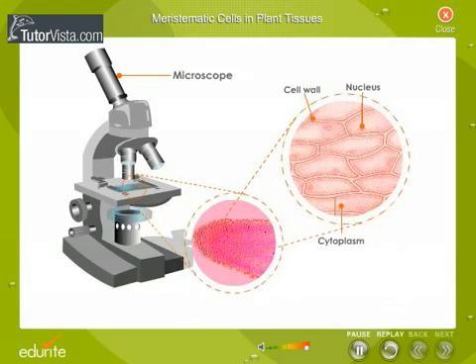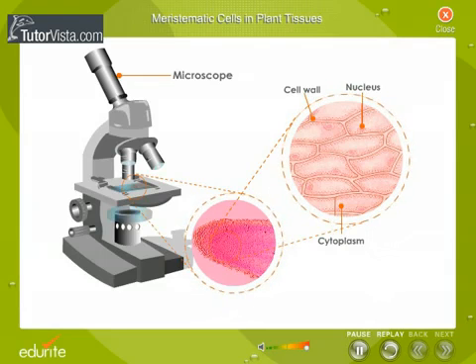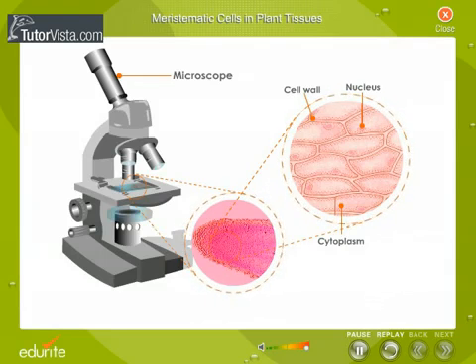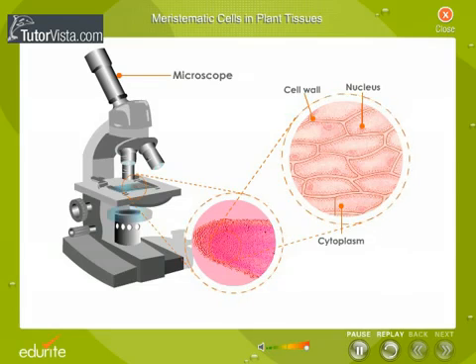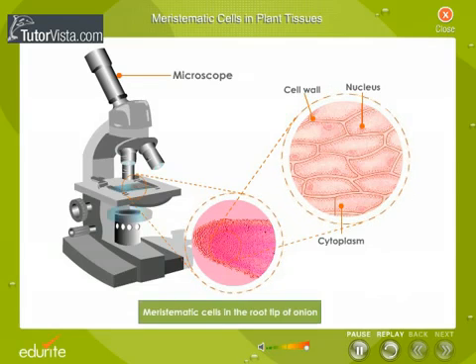Locate the thin-walled cells full of cytoplasm a little above the actual tip of the root. Note the large nucleus. These thin-walled cells in plant tissues are meristematic cells.